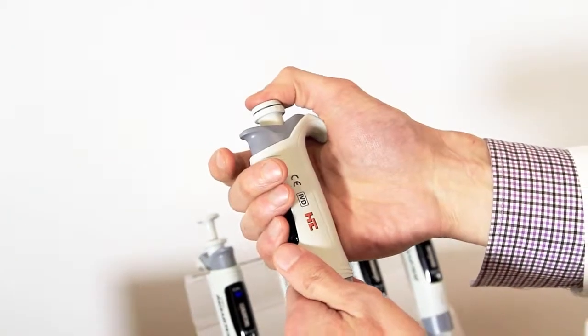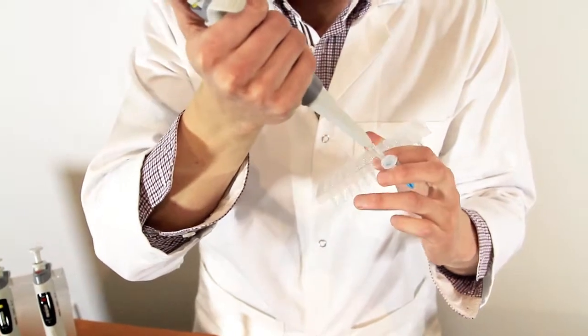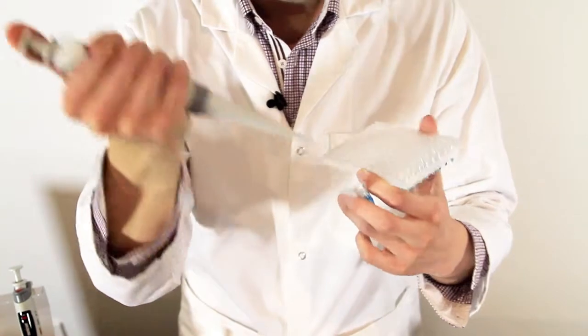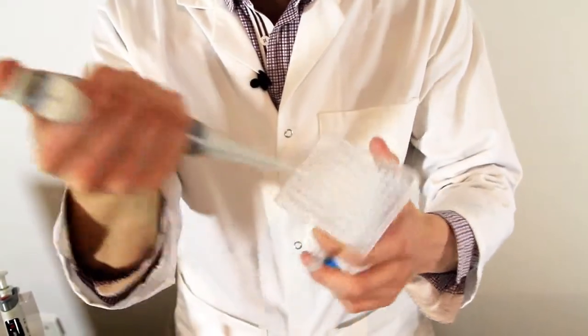So what are the caveats? As I've been demoing these, I've found that those with medium and large hands find the unit very comfortable. While HTL do say they designed the Discovery Pros with all hand sizes in mind, I think most users with small hands would prefer a smaller girth, such as found in PLP's LabNet bi-pipette range.